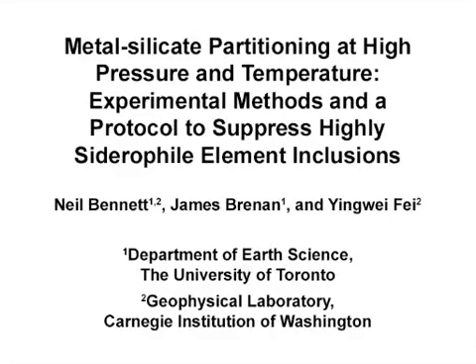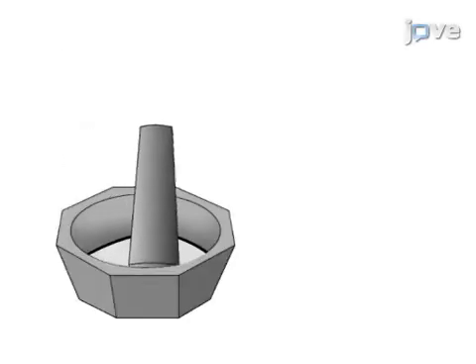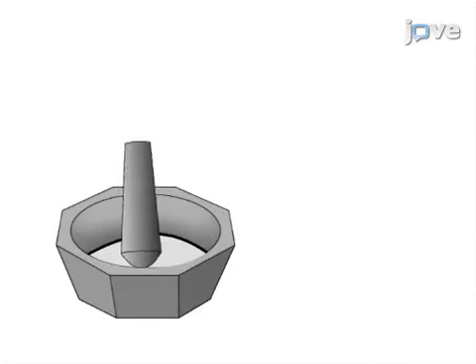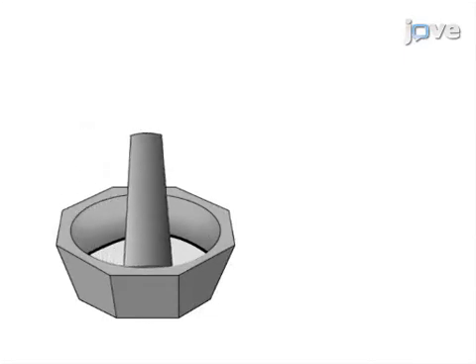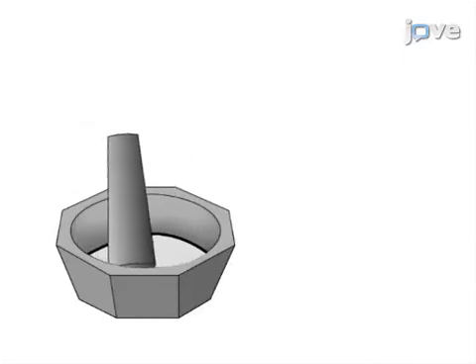The overall goal of this procedure is to determine the partitioning of highly siderophile elements between metal and silicate melts. This is accomplished by first preparing a synthetic silicate melt and metal starting material.